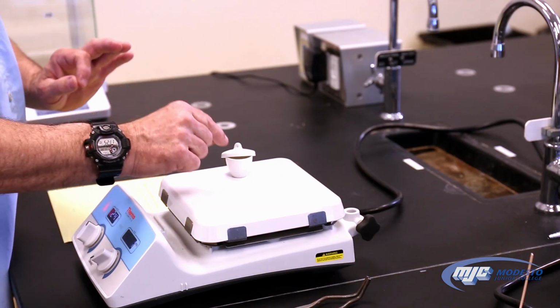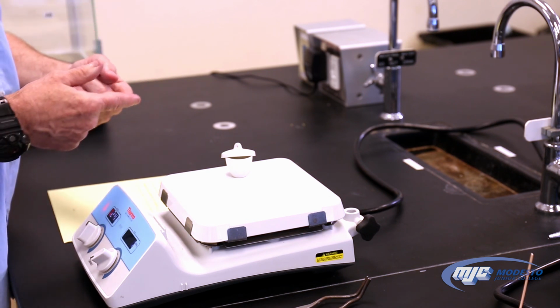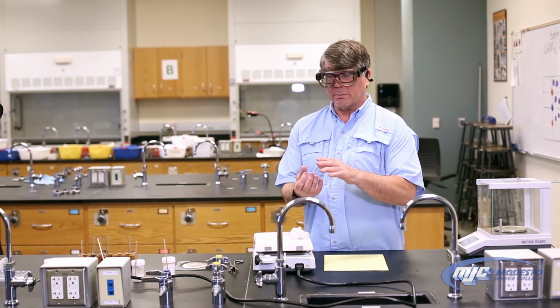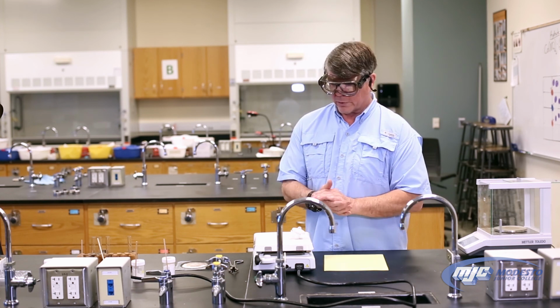The reason we have it cracked is that as those water molecules start leaving, they need some place to go. If we just leave it closed, what will happen is the steam will come up, and it is steam, hit the inside of the lid, condense and drip back down, and it'll never get dry pretty much.